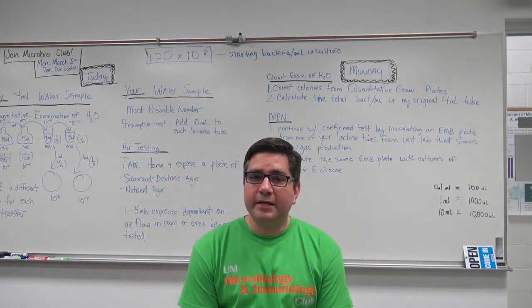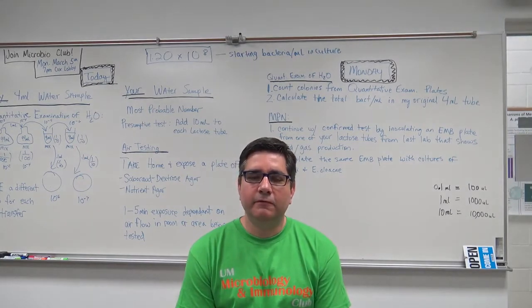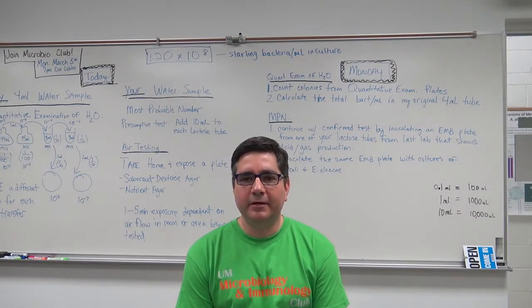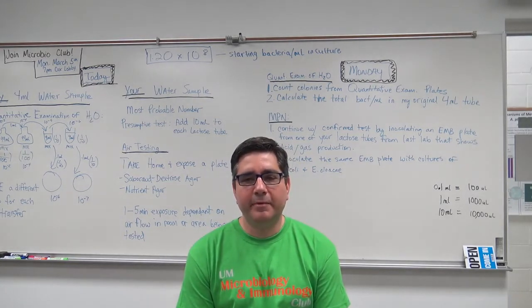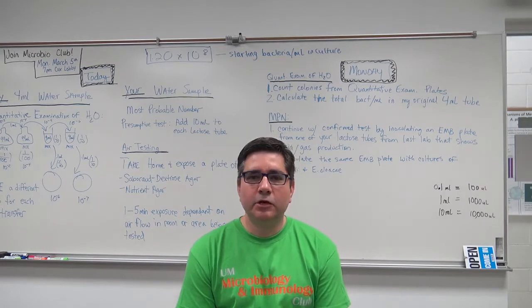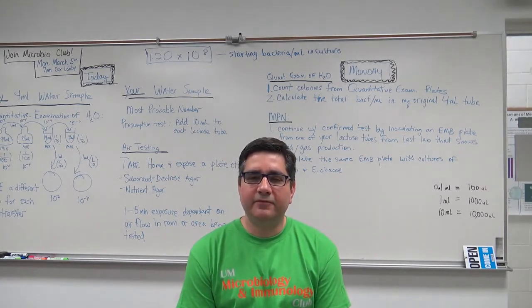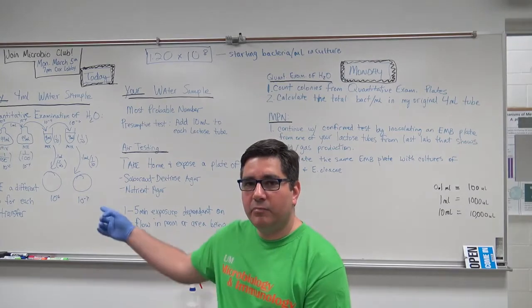Today, for the quantitative examination of water, you will be using the information from your colony counts to determine the number of bacteria per ml that are in the 4 ml broth culture that I have prepared for you today. These are located in the center of your bench. To accomplish this, we will learn a very important concept that you will need to master in any lab, which is how to conduct a serial dilution. I've noted this on the board.